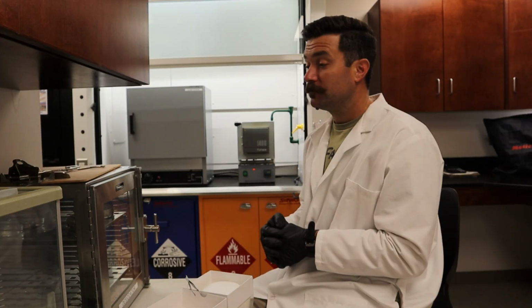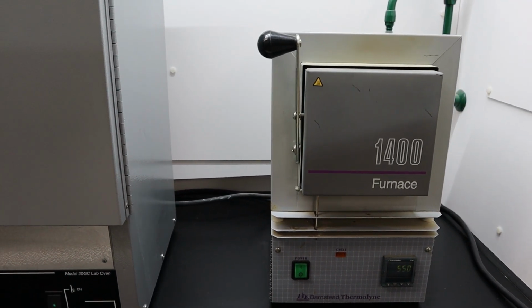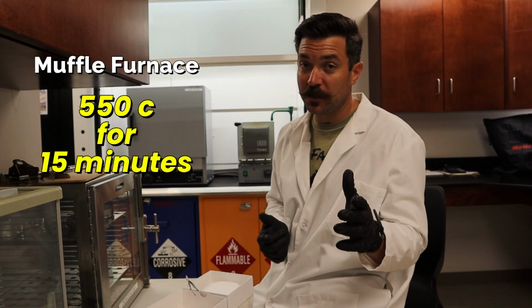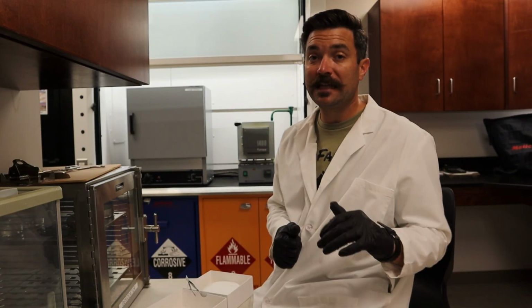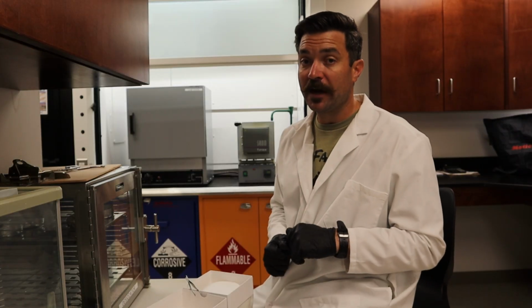Next, after you've weighed that sample, if you are going to be testing for the MLVSS, you then have to take it out of the analytical balance. You're going to be placing it in the muffle furnace. The muffle furnace is used in the wastewater world to cook off the solids. So it is set at 550 degrees Celsius. That's another exam question you're very liable to see. Having it set at that temperature is going to cook off anything organic on that filter. You simply place it in there and leave it in there for 15 minutes.